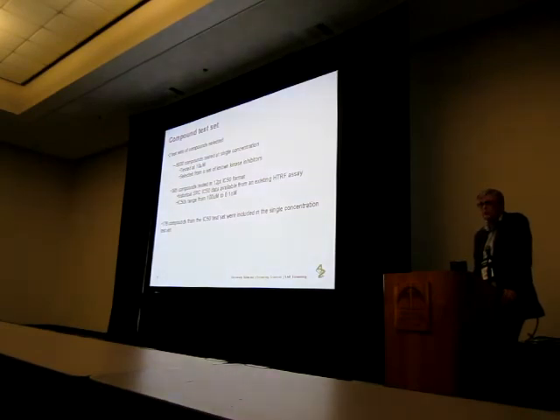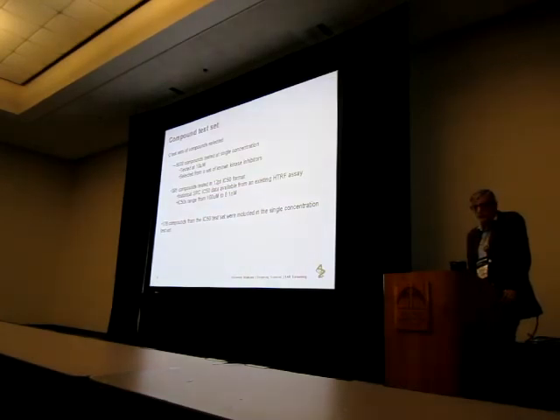Our typical dose response range that we use at AstraZeneca is a 12-point dose response, and it goes from 100 micromolar down to 0.1 nanomolar. So quite a wide range. Within the 395 compound test set, we had 178 compounds that we had HTRF IC50 data for, and we also knew were spiked into that 5,000 test set single point.